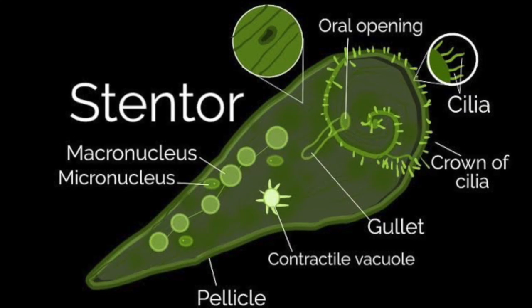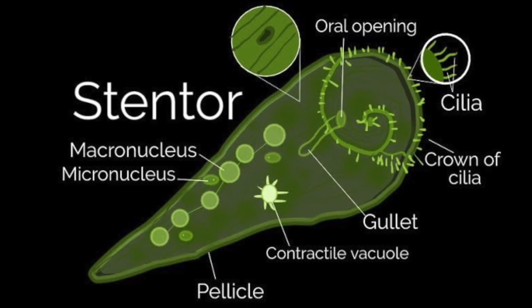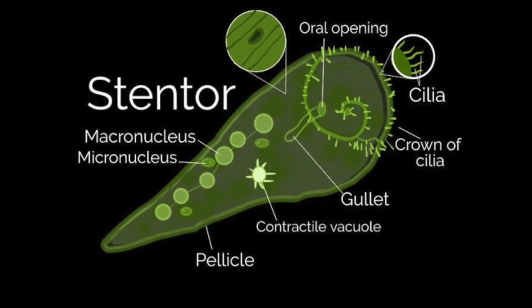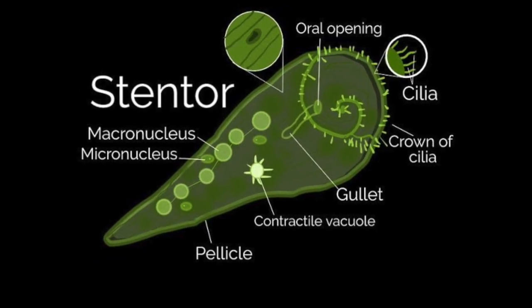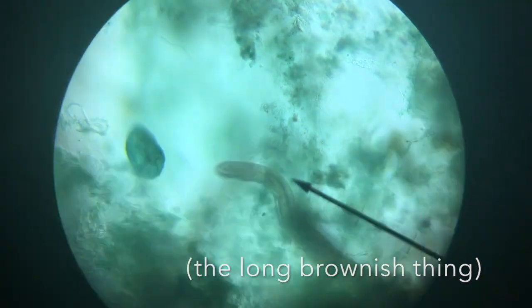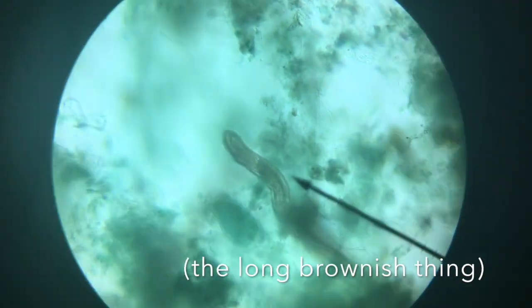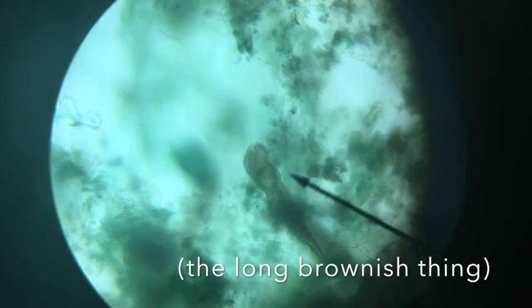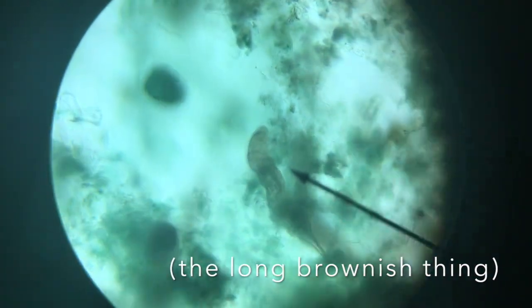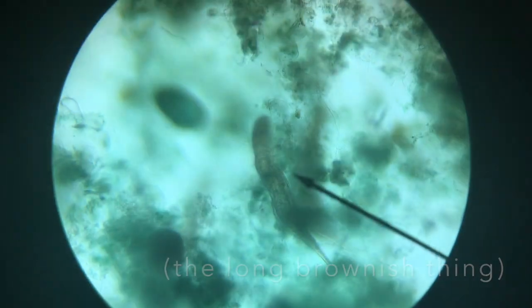Stentor ceruleus, commonly known as stentor, is under phylum Ciliophora. Stentors are heterotrophs and omnivorous — they eat other bacteria, and sometimes they are able to eat small multi-celled organisms. They move similar to the paramecium by beating the cilia that covers their body. They use their micronucleus for sexual reproduction, but they usually reproduce asexually through binary fission.